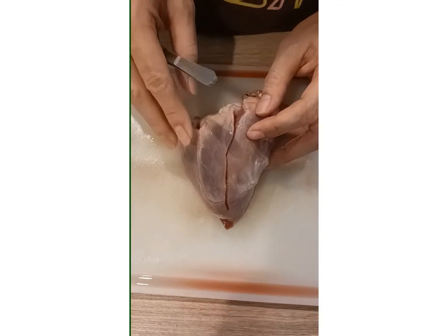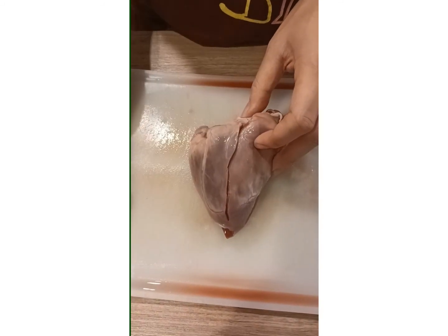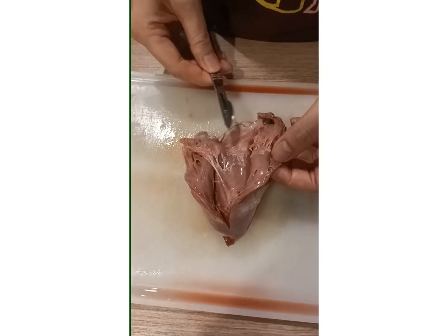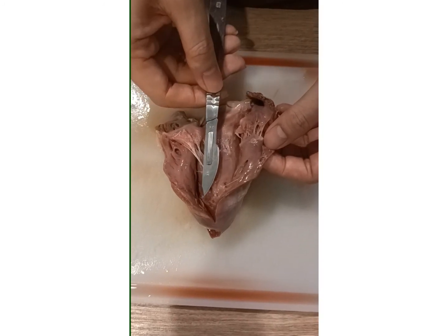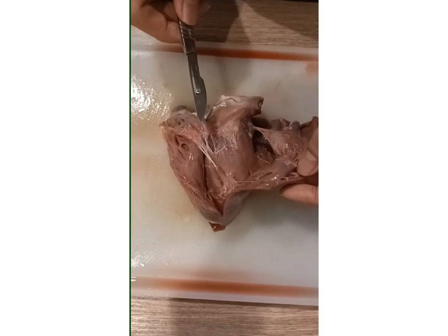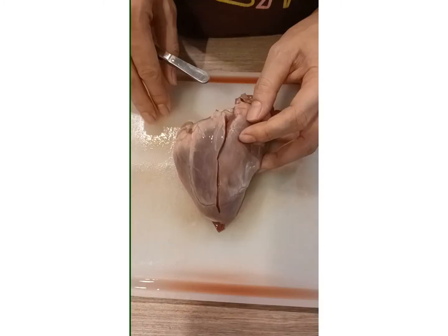Now we can dissect the right heart. You just turn the right heart upside, and then you use scissors or a knife to cut the right heart at the middle, and then you open it. So this one will be the vena cava, cut through the atrium, and then the right ventricle. This is the AV valve, and then this is the pulmonary artery.